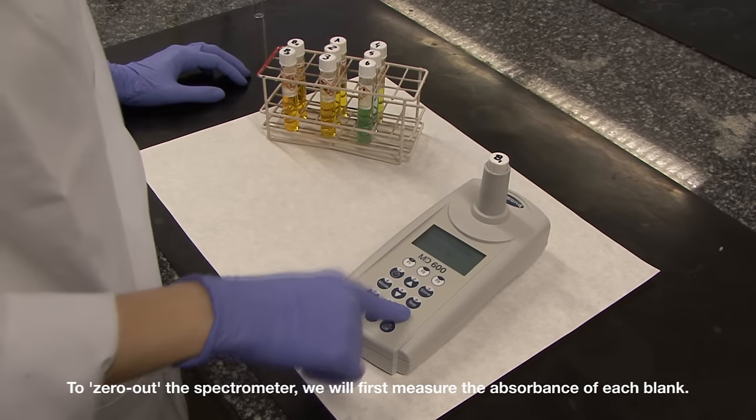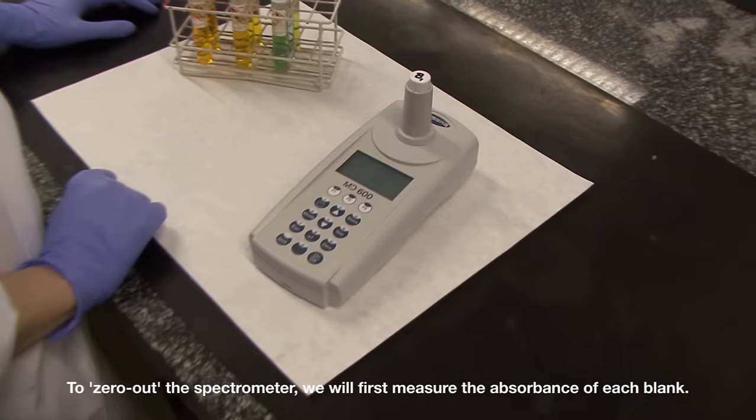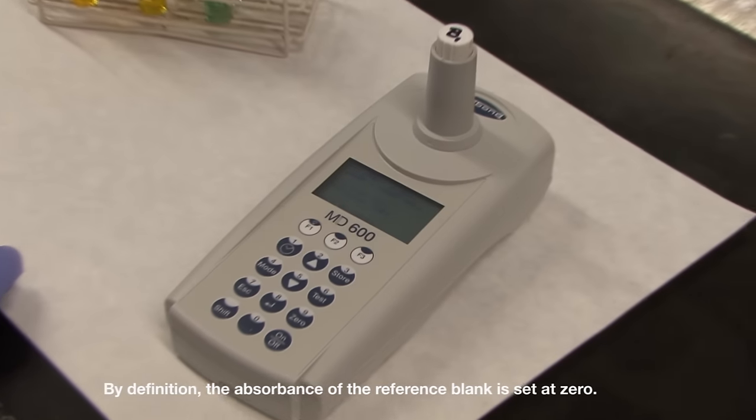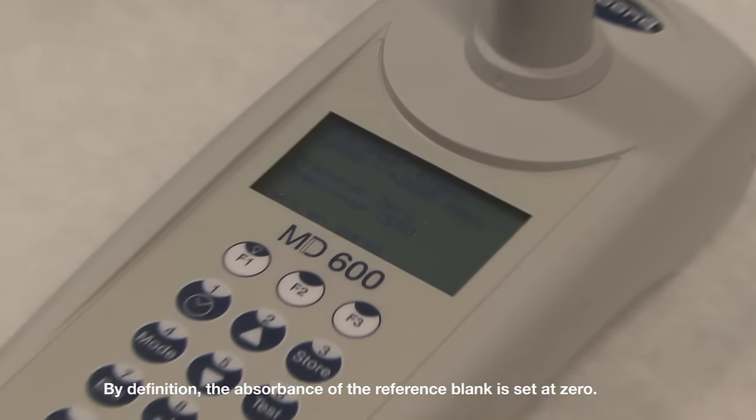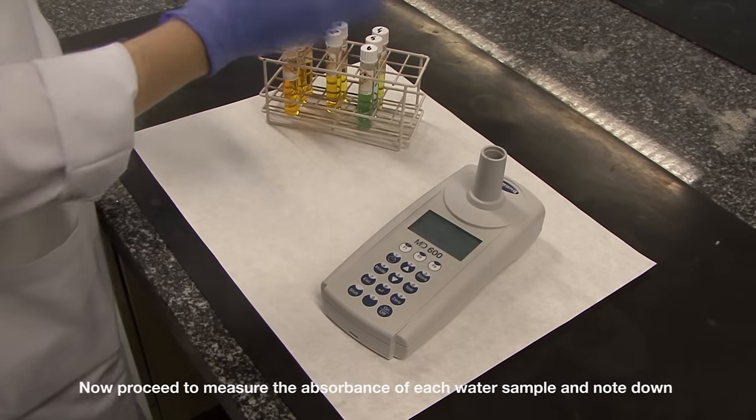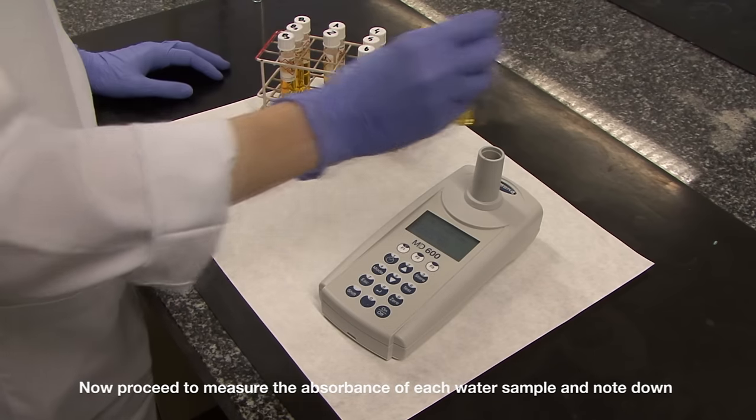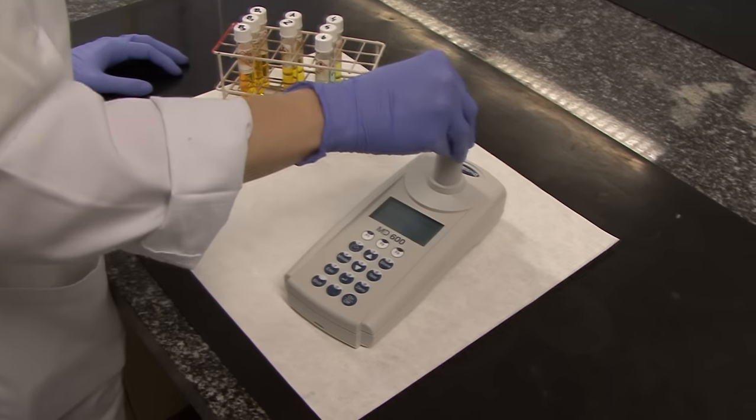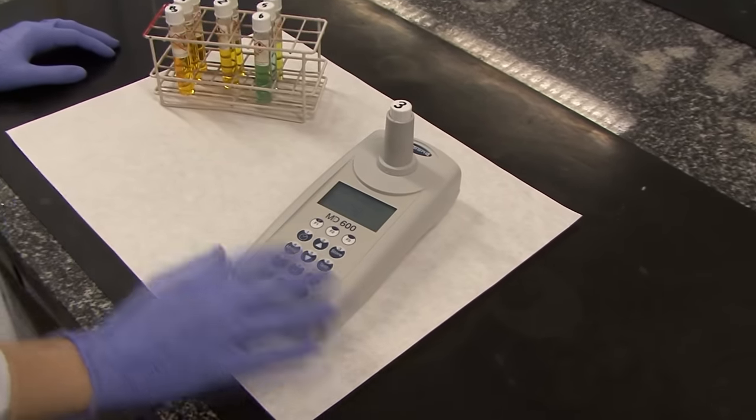To zero out the spectrophotometer, we will first measure the absorbance of each blank. By definition, the absorbance of the reference blank is set at zero. Now, proceed to measure the absorbance of each water sample and note down the absorbance value of each replicate.